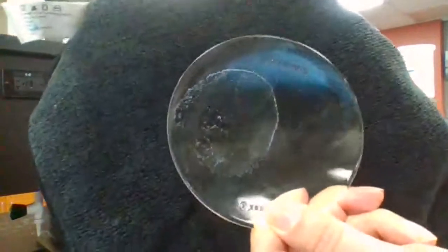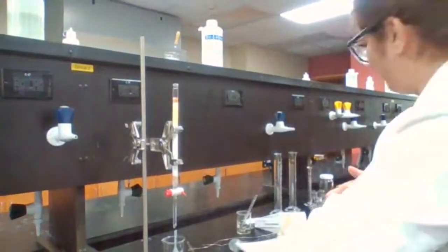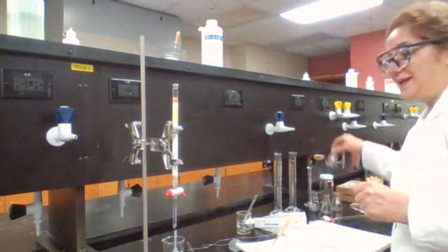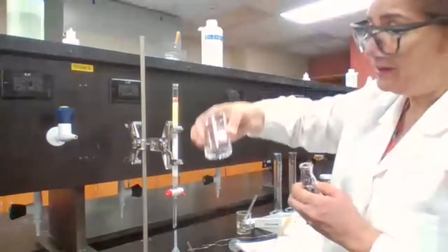Yes? Okay. That is the indication that my fraction 1, the fluorene, is now all the way down. And what's the next step for me to do? This is my waste container. The beaker is the waste container.